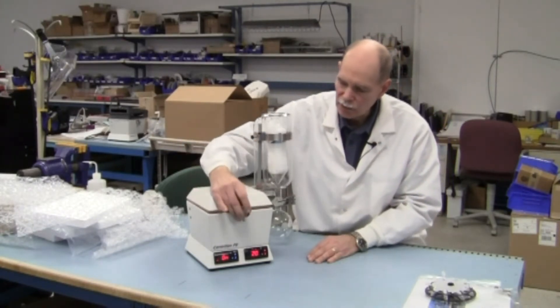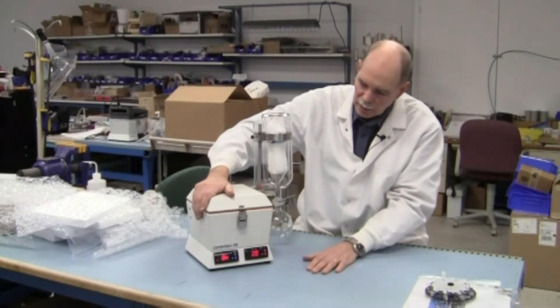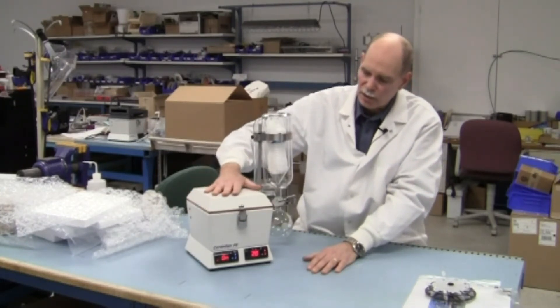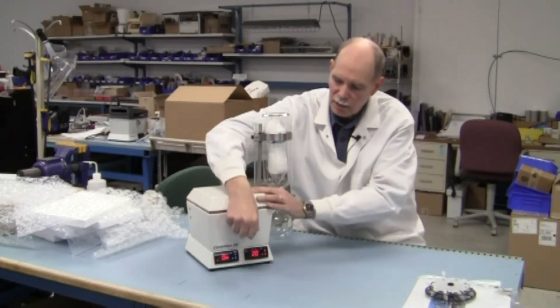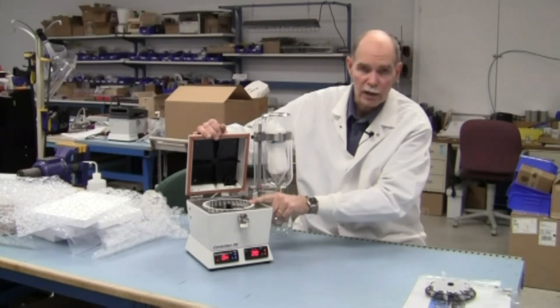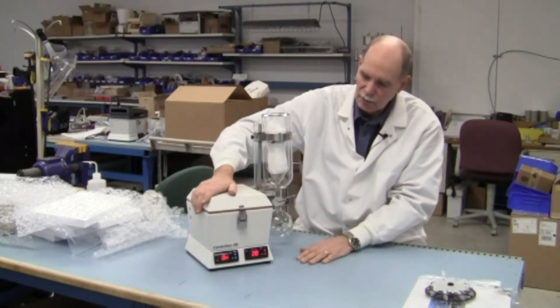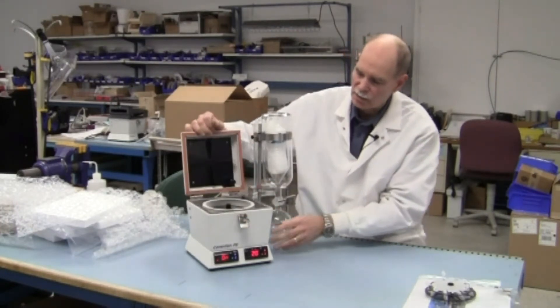You can check operation by starting the unit if the timer is set to on. Closing the lid will cause it to start spinning. There's a sensor switch in the lid which keeps the heater and the rotor off unless the lid is down and latched. Opening the lid you can see it's spinning. There's an electronic brake on the motor so it stops very fast — not like waiting for a centrifuge to wind down. Opening the lid causes it to stop.